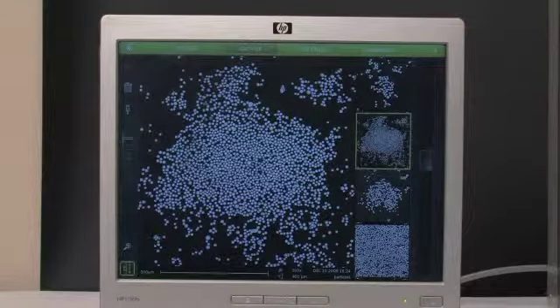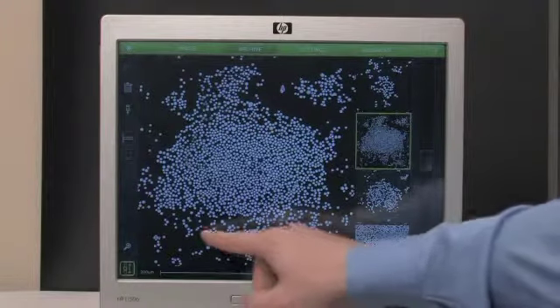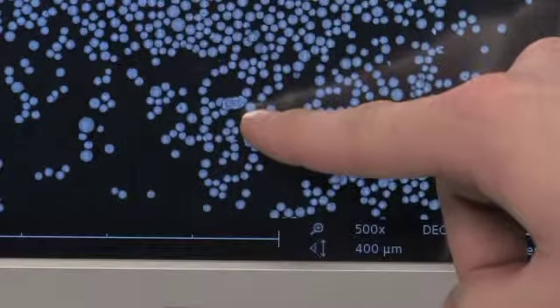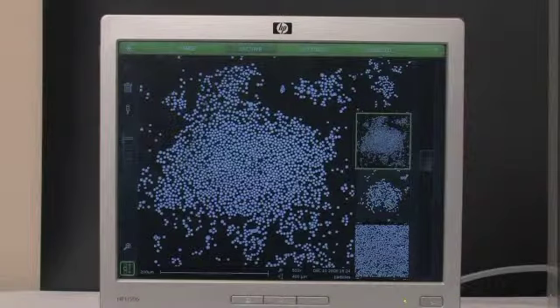Now, the other thing to pay attention to is there's also some variance in the size of these particles. So there's some larger particles here and here, as well as here. However, there are also some smaller particles. So even with the naked eye, you can see that there is variance among these particles. Now, just looking at them quickly, you're not going to be able to get any statistical data out of that. However, you can take this image, which is stored with a TIFF header, plug it into one of these off-the-shelf software platforms, and actually get statistically meaningful data out of them.